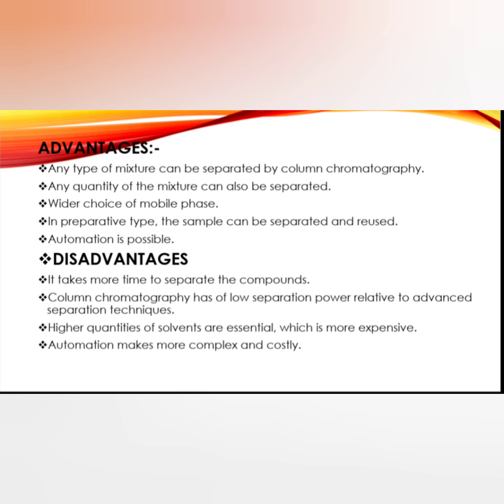And the disadvantages: it takes more time to separate the compounds. Column chromatography has low separation power relative to advanced separation techniques. High quantities of solvent are essential, which is more expensive, and its automation is more complex and costly. And these are the advantages and disadvantages of column chromatography.